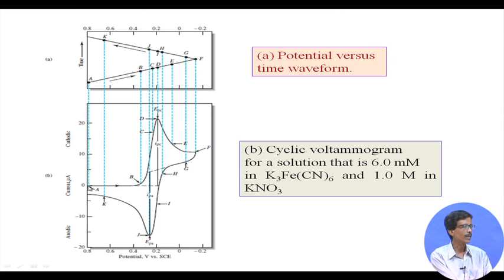Obviously, it is not matching again to 0. So, this residual current we have to accept because of the condition and the corresponding nature of the electron transfer reaction on the electrode surface. So, here also we again get two quantities, the peak potential as well as the corresponding current, which is your peak current for anodic scan, which is IPA.